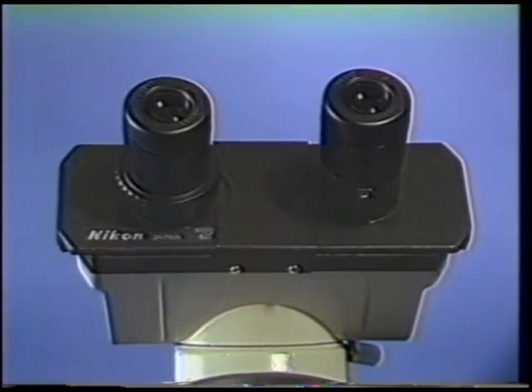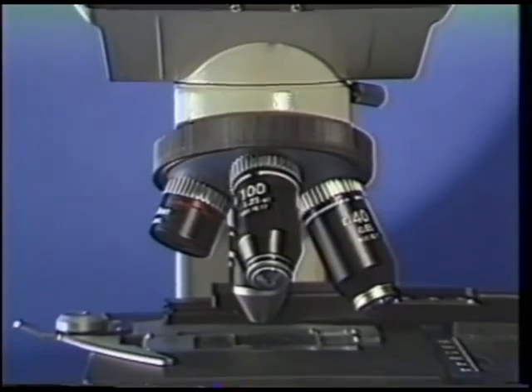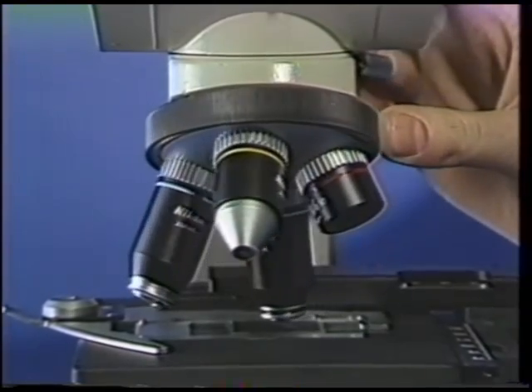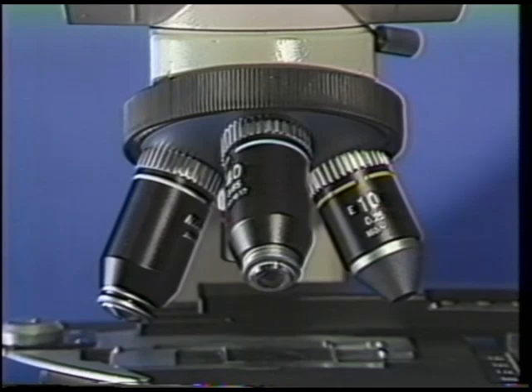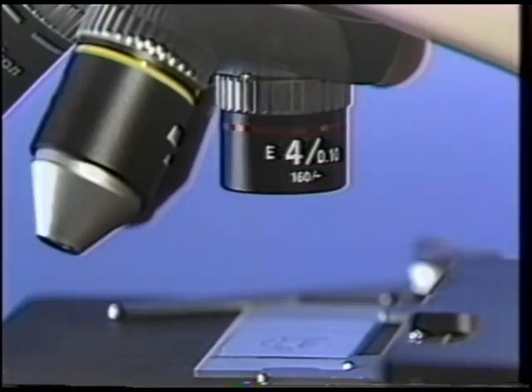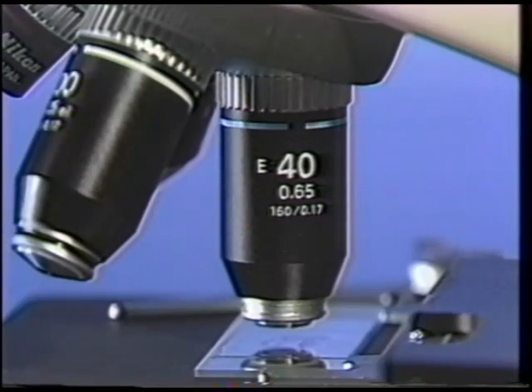Below the ocular region are the objective lenses. To bring a desired objective into place, rotate the revolving nose piece by firmly gripping the rubber knurled ring. Never swing the objectives into viewing position by grasping the objectives themselves, as it may damage the objective. To locate your specimen area, use the low power dry objectives, such as the 4X and 10X. The 40X dry objective is used for higher magnification.